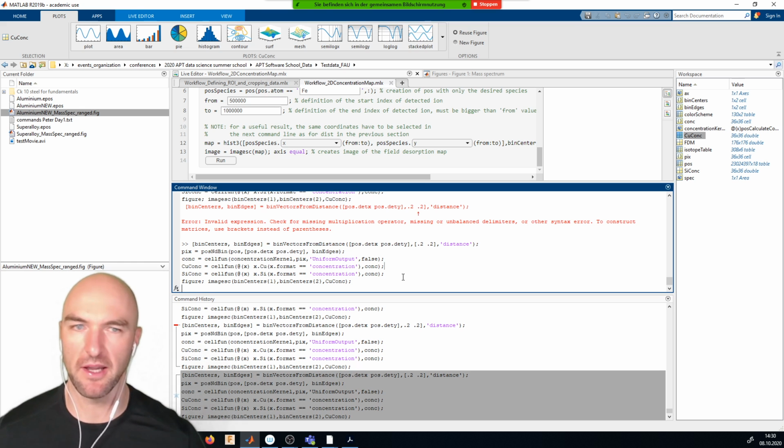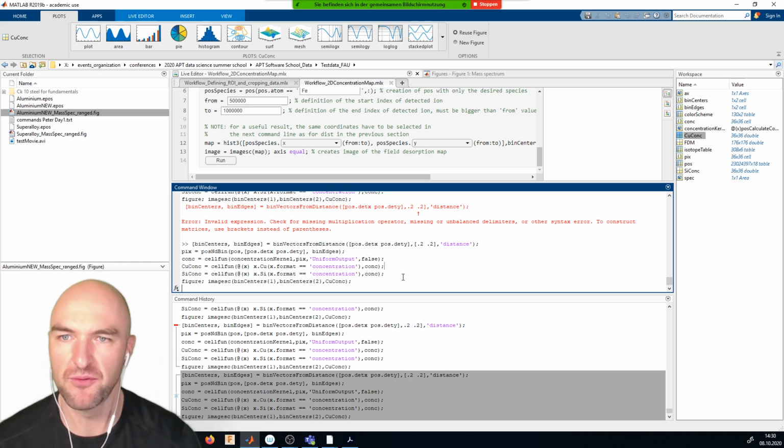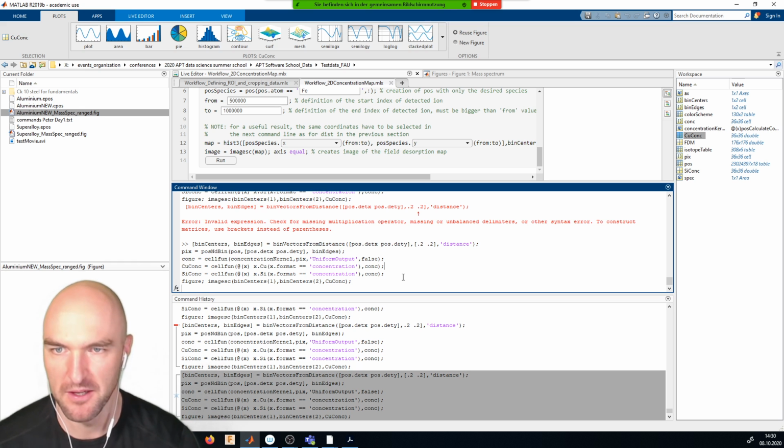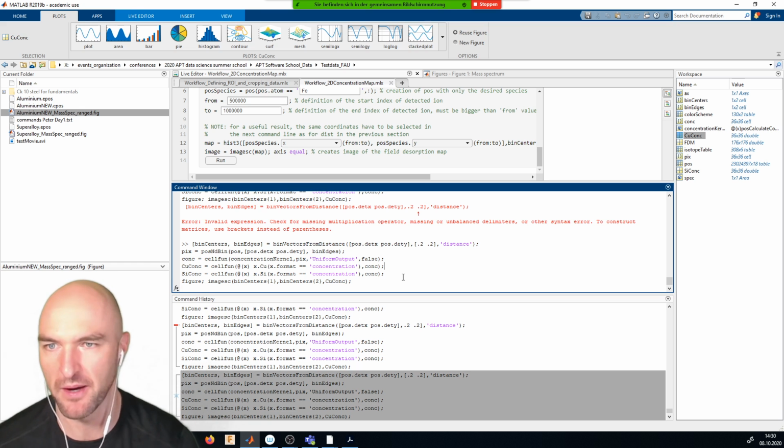And if you look into our code, there is actually a whole lot of different distance functions that you have. So right now, I've shown you obvious distance functions like detector x coordinates, detector y coordinates, x, y, z coordinates, and so on and so forth.